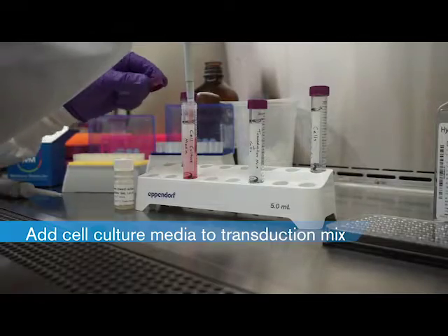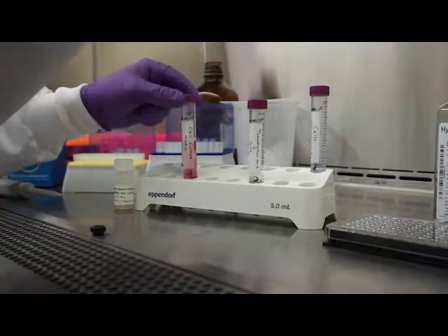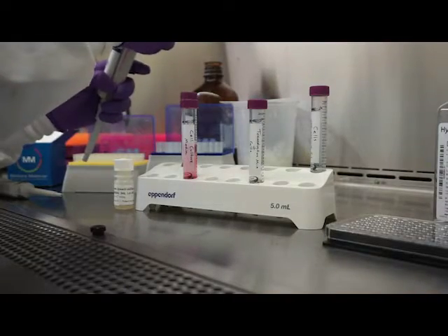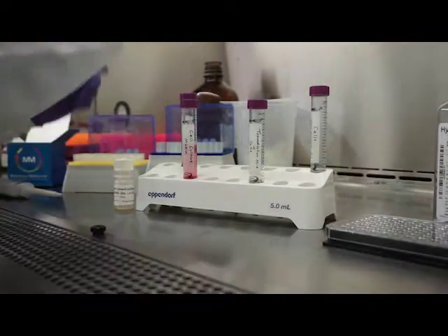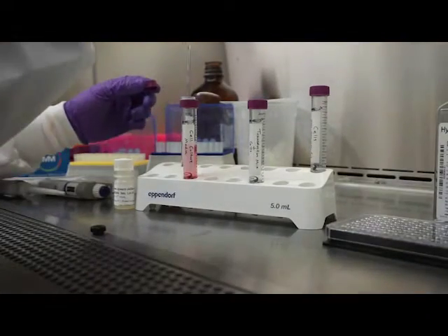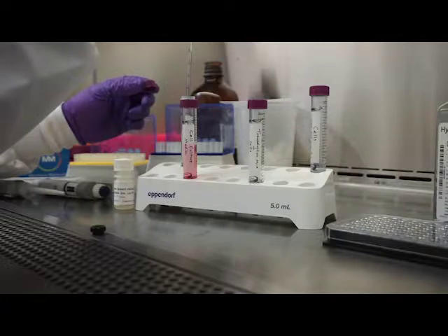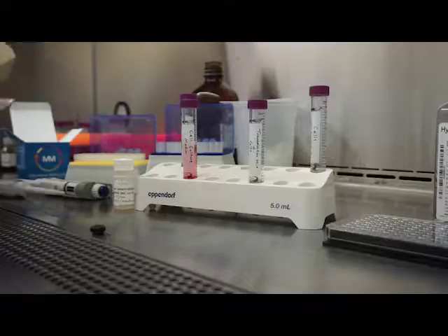Because HEK-293 cells have an endogenous receptor that can be activated by isoproterenol, we will not be using the receptor control today. Another component that could be added to the transduction mix would be an additional sensor BACMAM stock — for example, a red calcium sensor to pair with green CATIS. Mixing multiple baculoviruses works quite well.